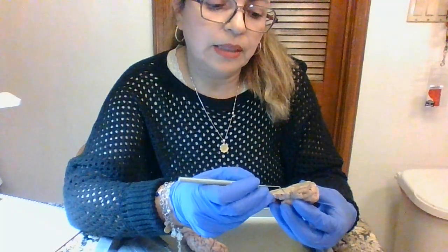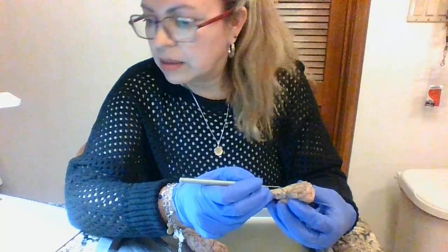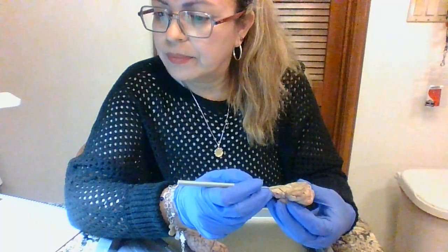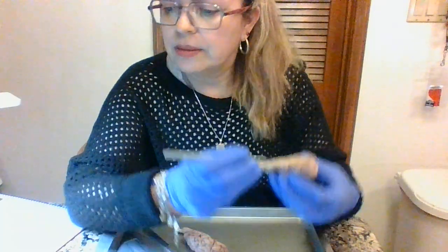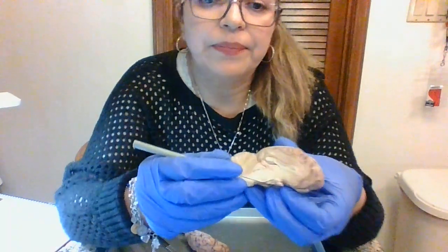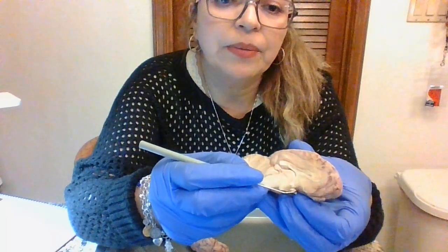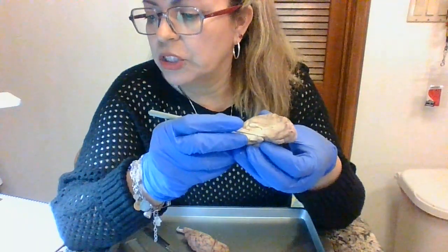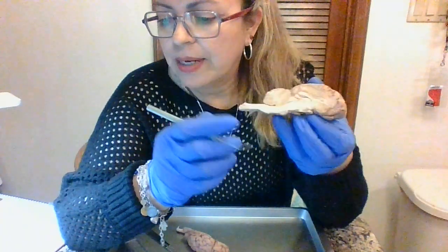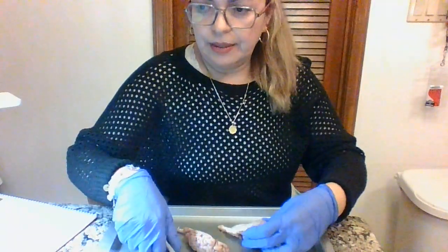Next, we have the optic chiasm. Yes, the optic chiasm is right here. As you can see, this thing hanging down here is called the optic chiasm and contains fibers that signal visual information. Okay.